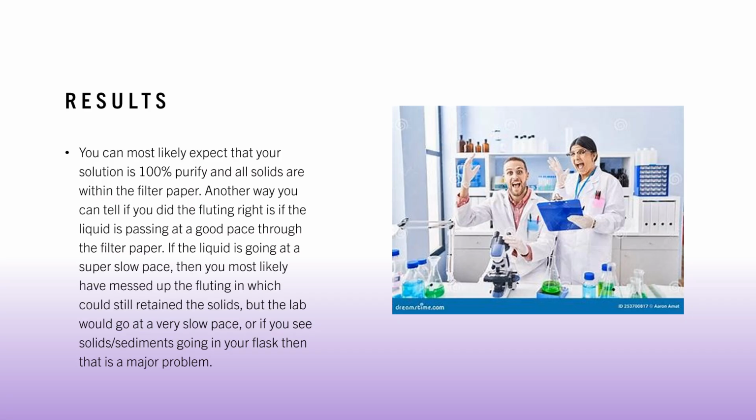So results. You can most likely expect that your solution is 100% purified and all solids are within the filter paper. Another way you can tell if you did the fluting right is if the liquid is passing at a good pace through the filter paper. If the liquid is going at a super slow pace, then 100% you probably did mess it up, and some of the solids could be going through the filter paper, which could lead to not so good results.